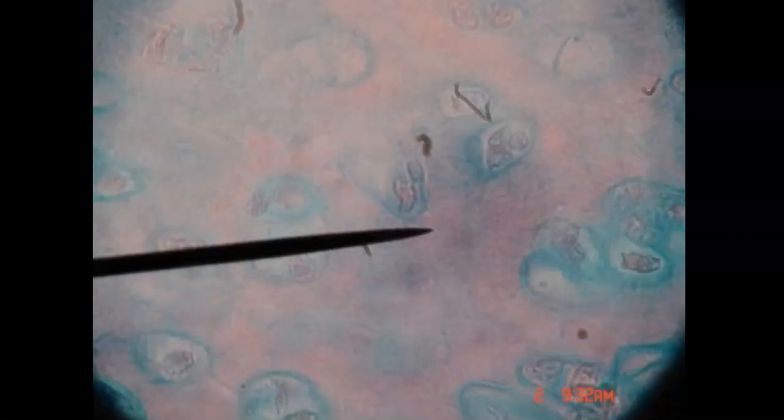And here's another microscopic image of hyaline cartilage. This is not as great of a microscopic image, but this is something that you might see in the lab. But again, in the extracellular matrix, it's very glassy in appearance. You don't have any visible protein fibers.